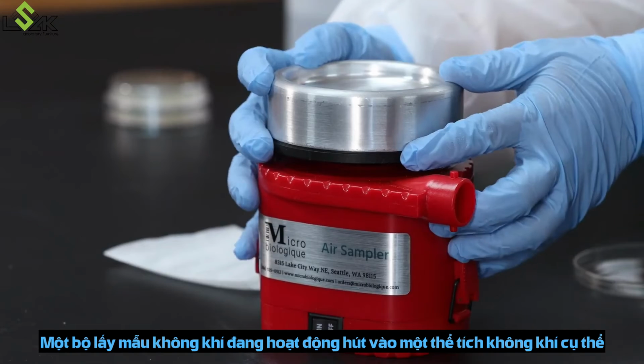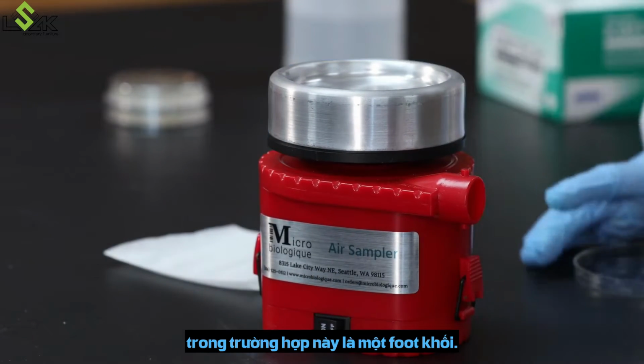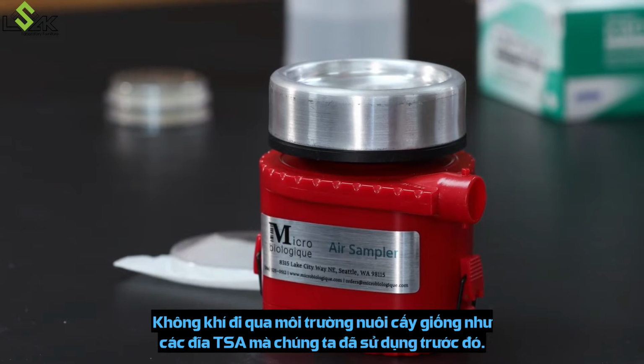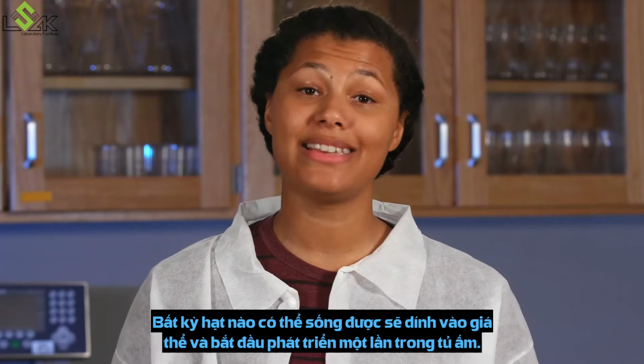An active air sampler draws in a specific volume of air. In this case, 1 cubic foot. The air passes across a culture medium much like the TSA plate we used earlier. Any viable particles will stick to the media and begin growing once in the incubator.